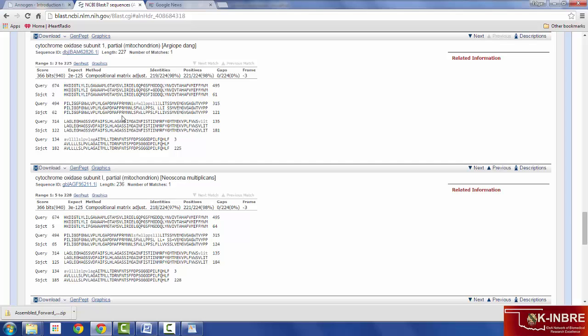The algorithm's goal is to position the characters in such a way between both sequences that maximizes what are called identical matches in the vertical columns, and to minimize mismatches and gaps within the vertical columns. And if we observe this alignment here, we can see that in the middle will highlight whether or not the match is an identical match by representing the character in the middle line, or if it is a mismatch, you'll either see a gap here, an empty space, or you may see a plus sign.